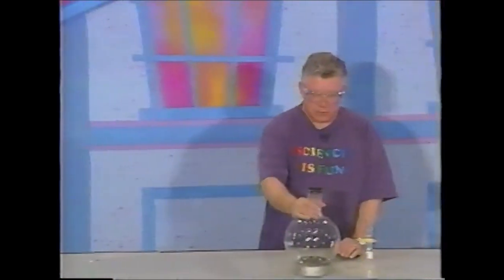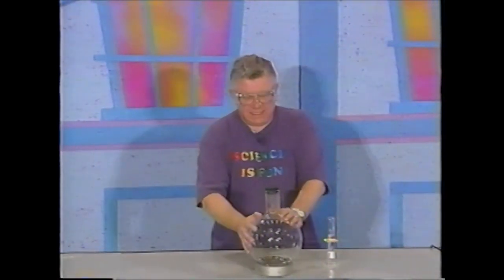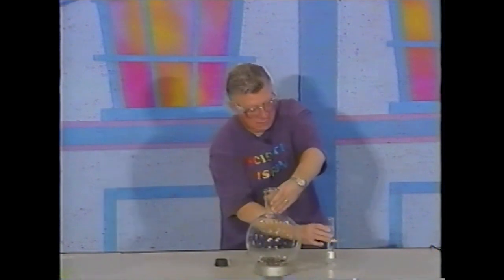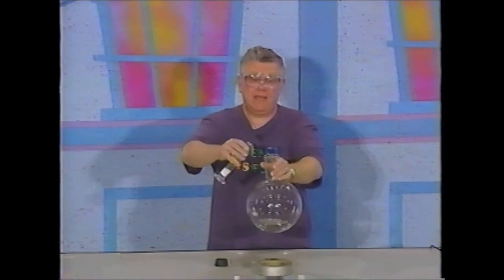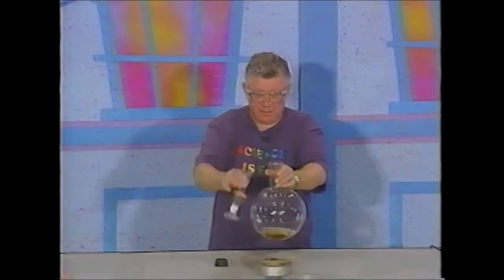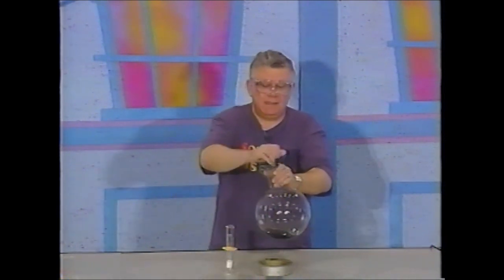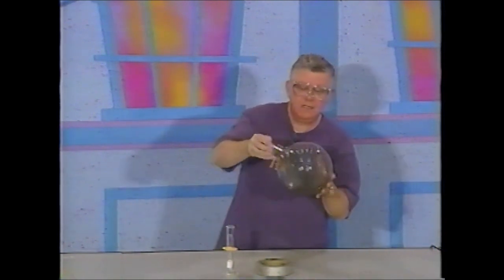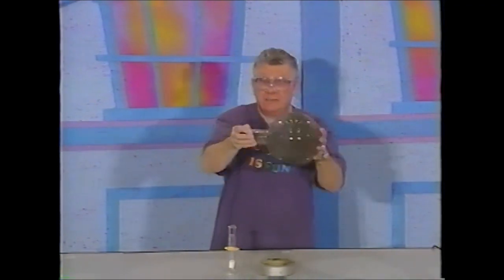All right, now we'll do this experiment in a flask that has a clear and colorless liquid at the bottom. And I also have another clear and colorless liquid that I'm going to mix in this big flask with what's in it already. And you know that a chemical reaction takes place when you see color changes. You can see that we have a dark liquid now. We started out with clear and colorless liquids. But for a chemical reaction to take place, we have to mix the chemicals very, very well.